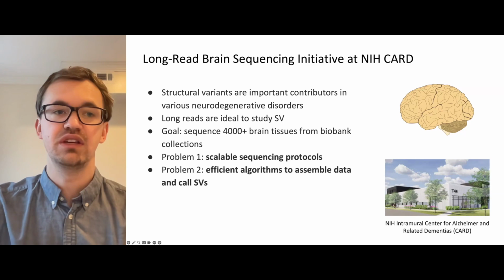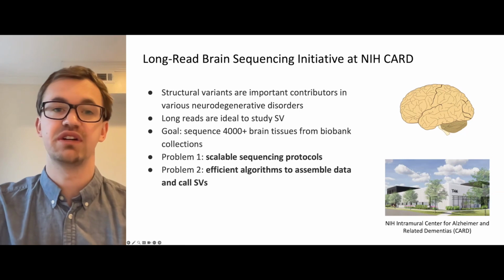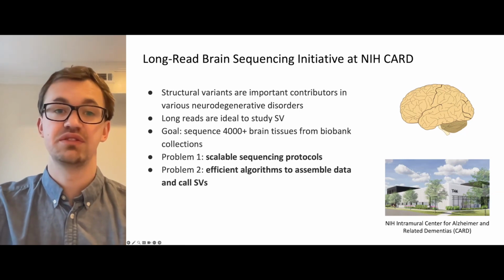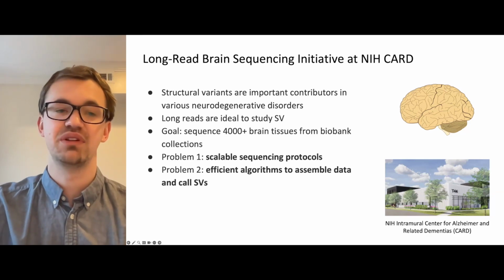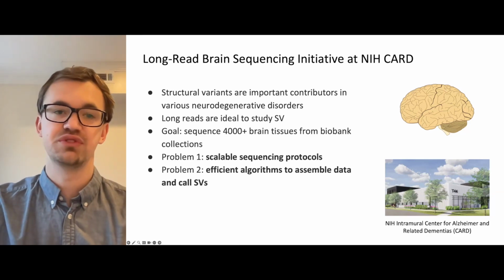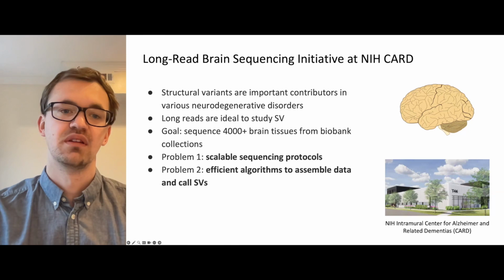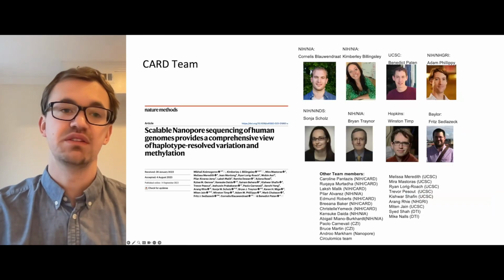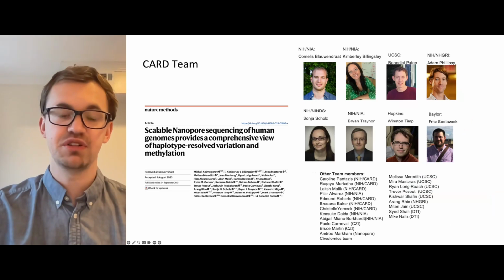The ambitious goal is to sequence over 4,000 brain samples from various biobanks, various cohorts, and there are 2 obvious problems. First, we need really scalable long-read sequencing protocols. And secondly, we need efficient algorithms to analyze this data. And so this work that I will be presenting has recently been published.